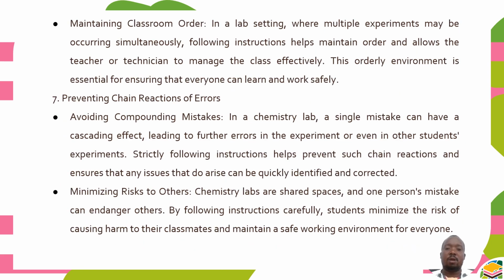Maintaining classroom order: in a lab setting where multiple experiments might be occurring simultaneously, following instructions helps maintain order, and it allows the teacher or the technician to manage the class effectively.